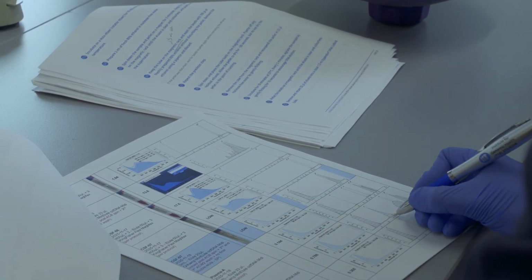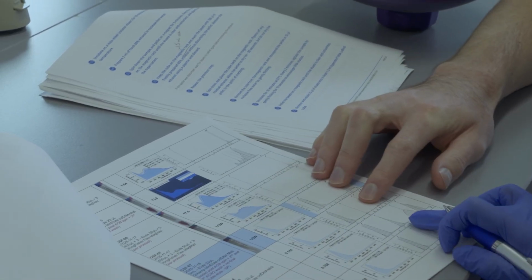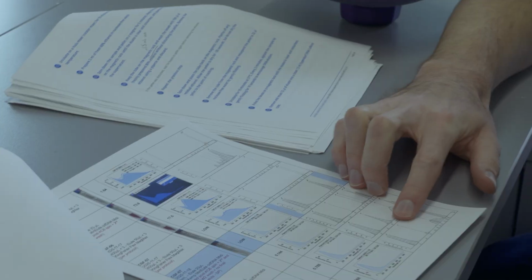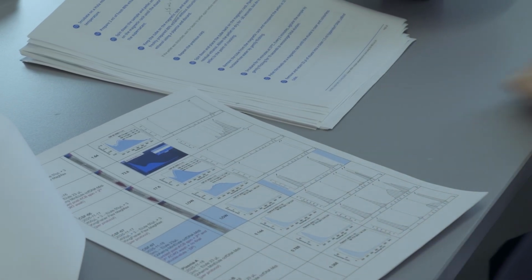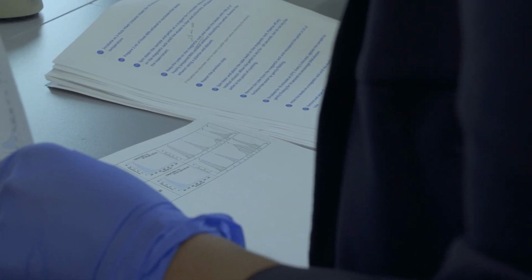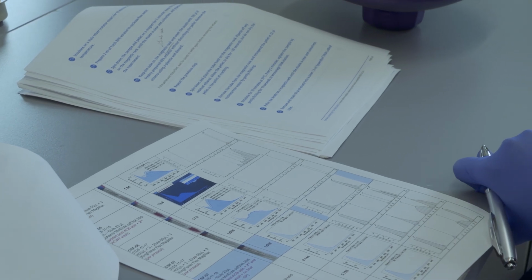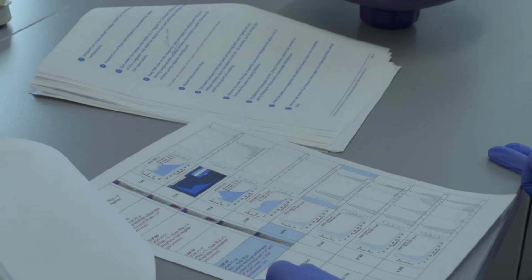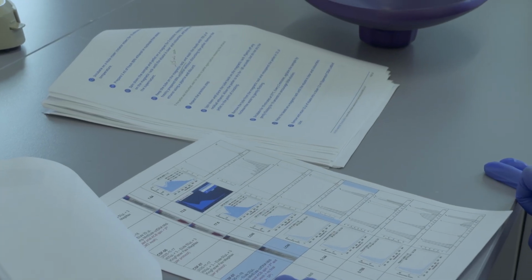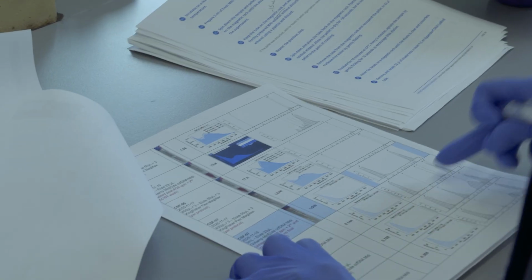This is close to 170 or something, right? Or 150? They were a little shifted low for the plasma. This is 108, 104, 107. Yeah, plasma it was different. I don't know how. CSF we got in the correct range, but the plasma, even the NanoDrop was different. If you look at it, the peak was shifted. Per the documents, quantities look straight.